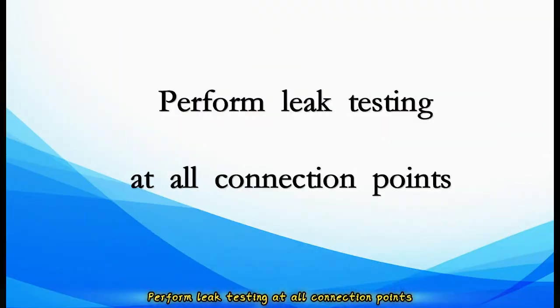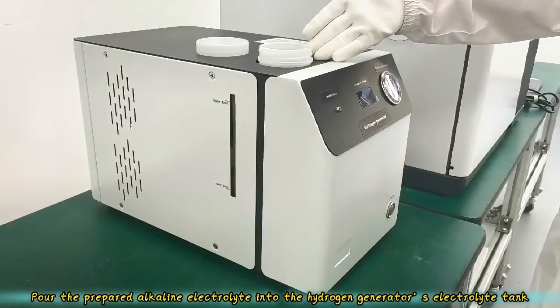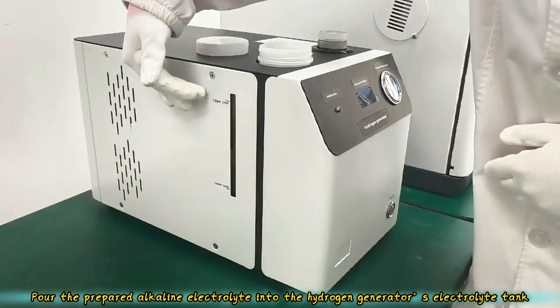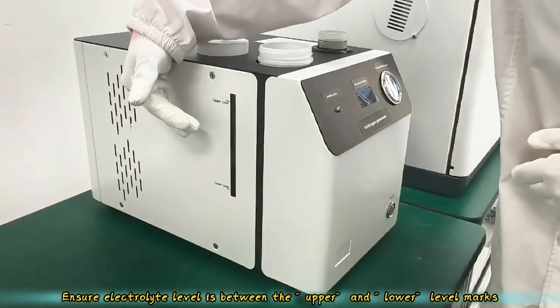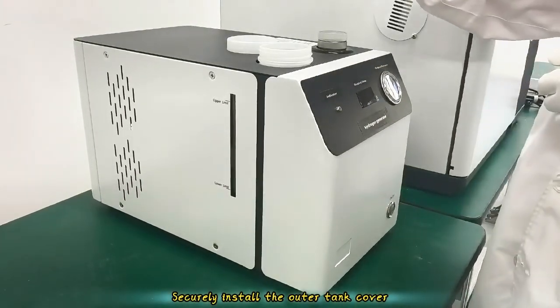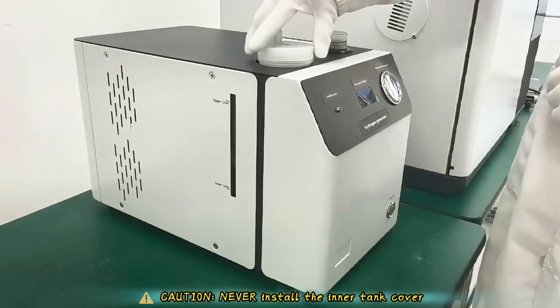Perform leak testing at all connection points. Step-by-step alkaline electrolyte preparation. Pour the prepared alkaline electrolyte into the hydrogen generator's electrolyte tank. Ensure electrolyte level is between the upper and lower level marks. Securely install the outer tank cover. Caution: never install the inner tank cover.